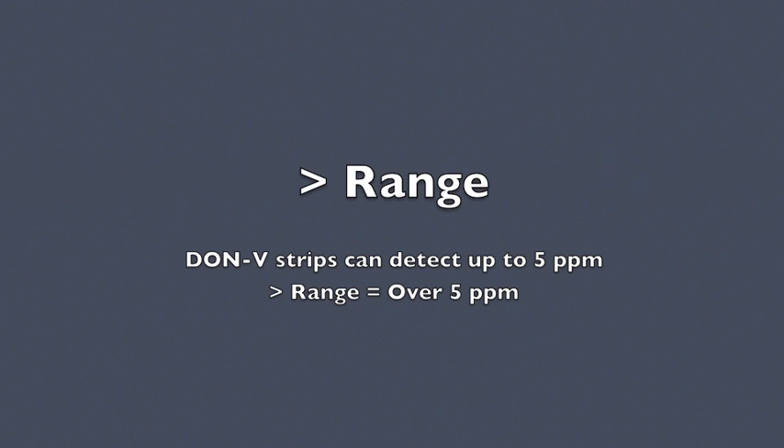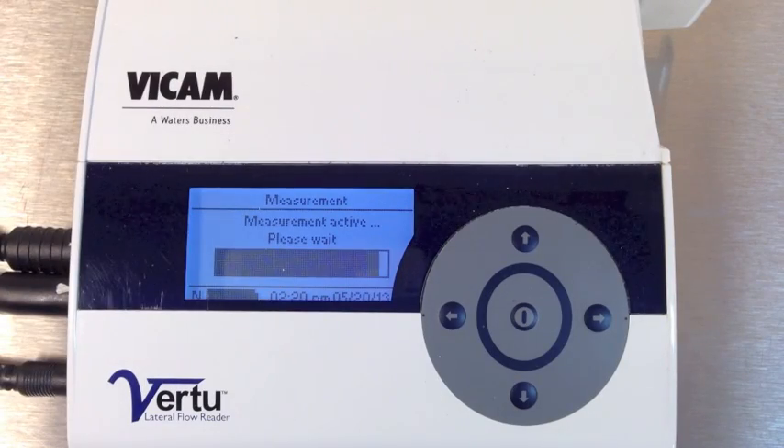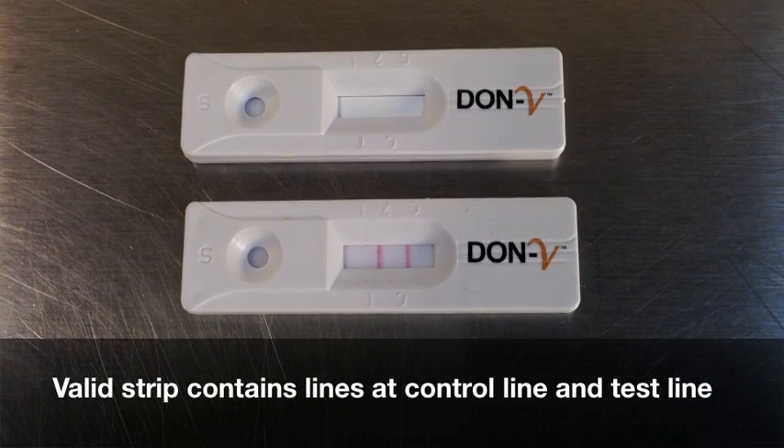If the reader displays 'greater than range' as a result, the sample contains more than 5 parts per million of DON toxin. If the reader displays 'invalid' as a result, a strip error has occurred. A valid strip contains both a test and control line after 3 minutes of developing. Contact Vicam Tech Services for assistance.